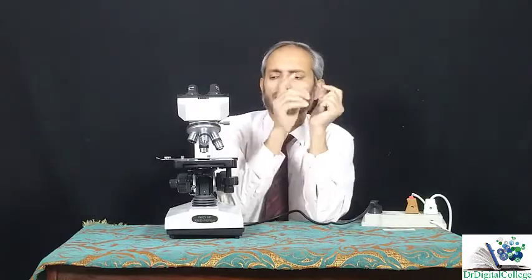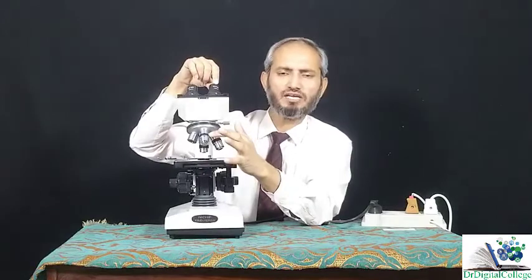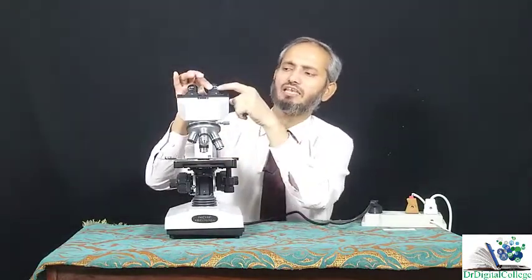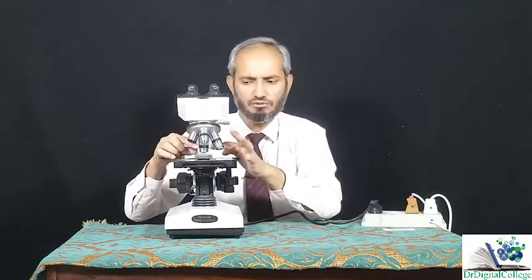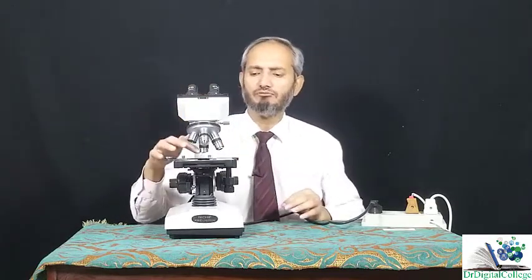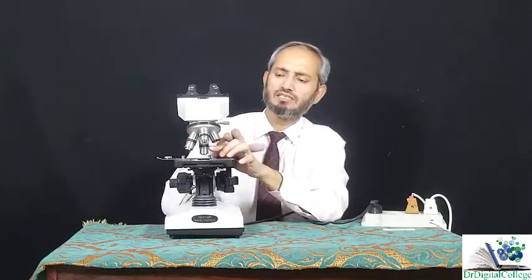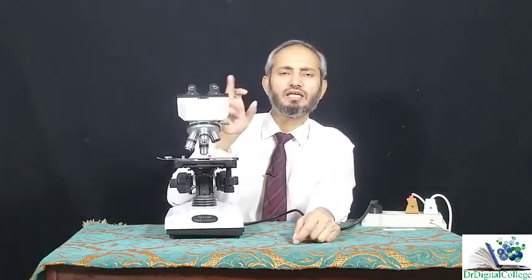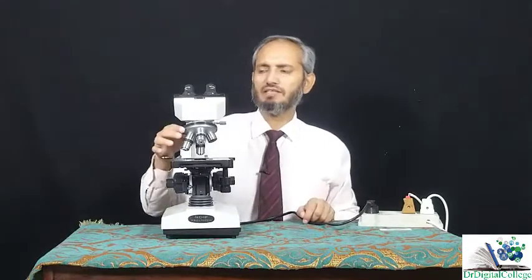this light microscope. The total magnification of your object will be the magnification given by the eyepiece lens and the magnification given by the objective lens. Say for example, I am using a 10x eyepiece lens and this 10x objective lens. So the total magnification of my object will be 10 into 10, 100x. If I am using 4x here and 10x here, the total magnification will be 10 into 4, 40x. Or if I am using this one, this is 40 and this is 10, 40 into 10, 400x magnification will be there. Okay, so this is all about the objective lens and the eyepiece lens.